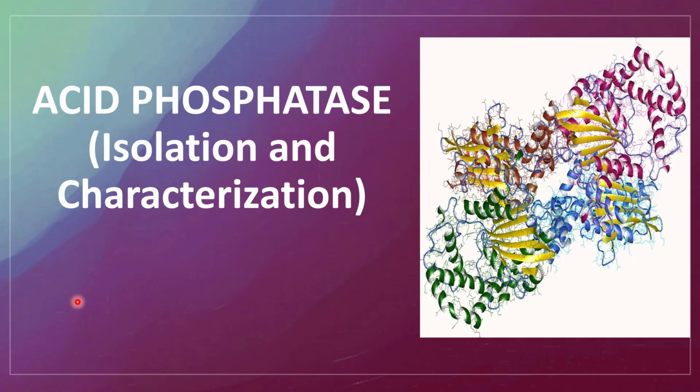In today's class and video, we are going to look at an important enzyme that we are going to use in our mini project, acid phosphatase. Basically, we are going to look at its isolation and its characterization.